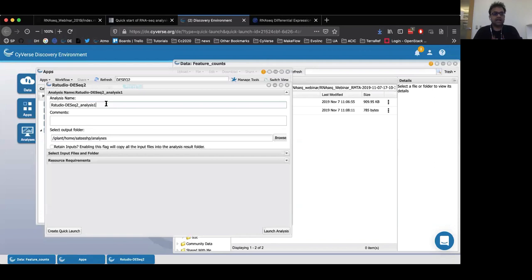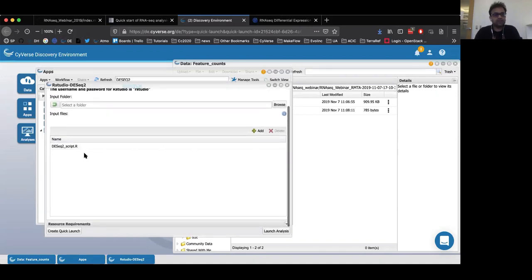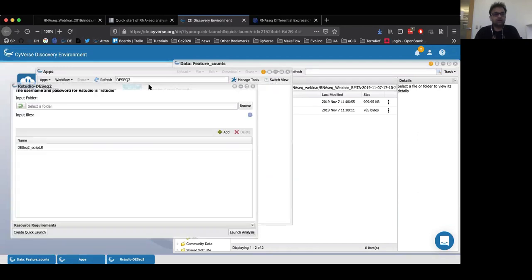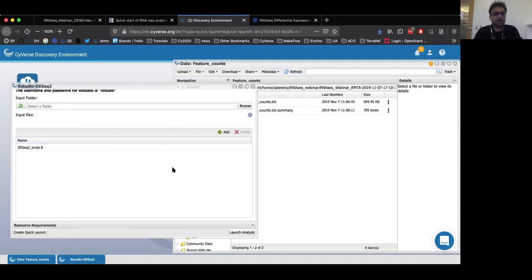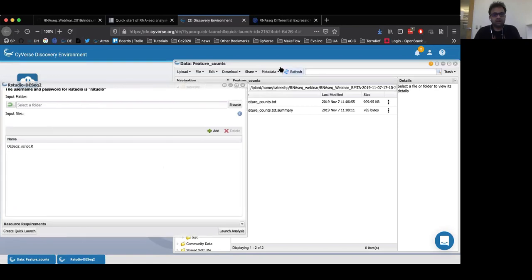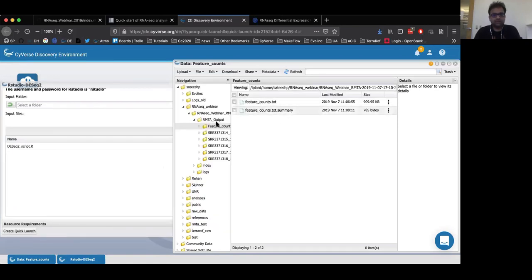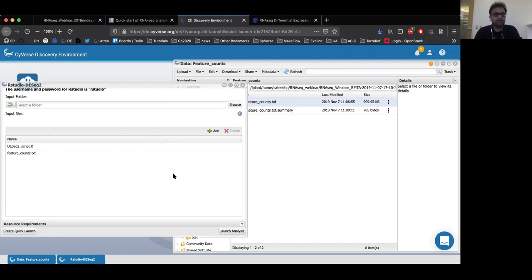In the input files and folder section, you can see that I have loaded the DESeq2 script. Now all we need to provide to this app is the feature counts file from our RMTA run. The feature counts file will be in the RMTA output folder, and I'm going to drag and drop that into the DESeq2 app window. Now that we have the count file and the script, I will click on launch analysis.